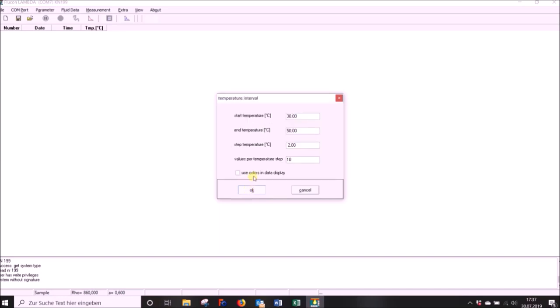Click on OK and type in your temperature settings such as the start temperature of your run, which should be above your actual temperature, the end temperature of your run, which should be below the flashpoint of your substance, the temperature increments, as well as the number of isothermal values that you want the system to determine at each increment.